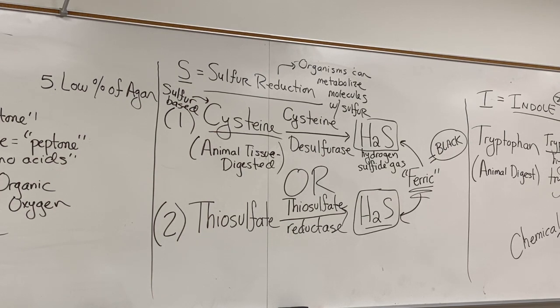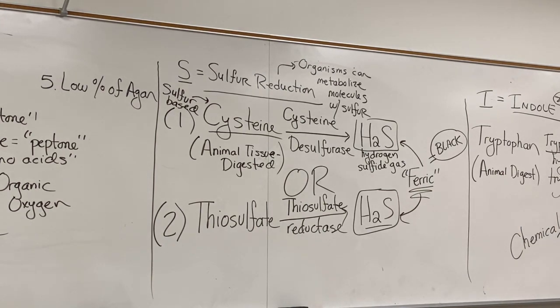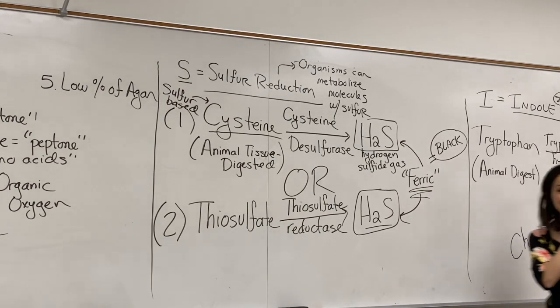Related to that question, we have a lot of different parts that are differential, because it's not just the chemical. You could say that the animal digest helps with the color too. The ferric part can help with the color development. So yes, definitely.